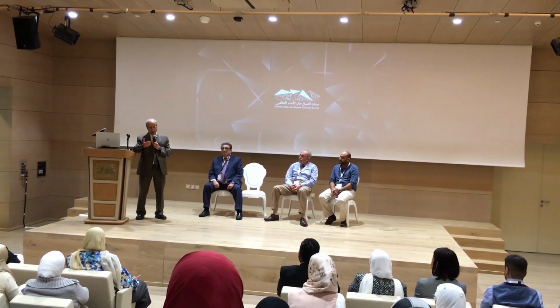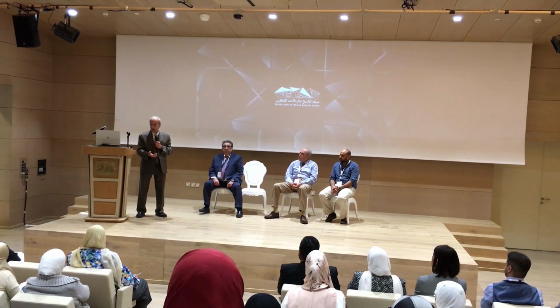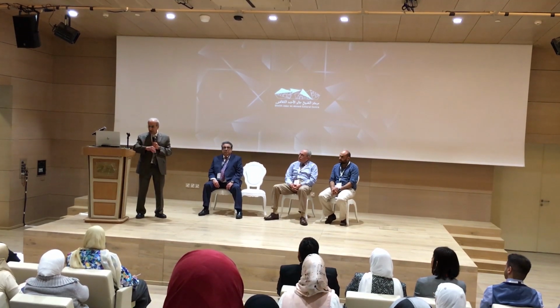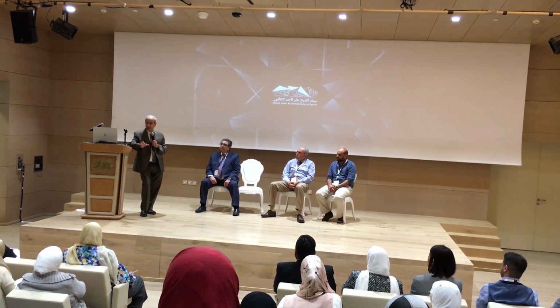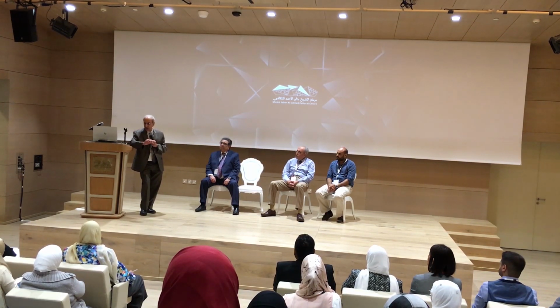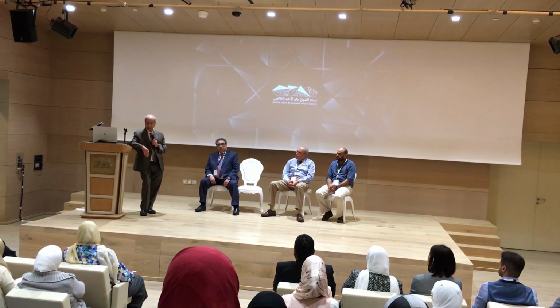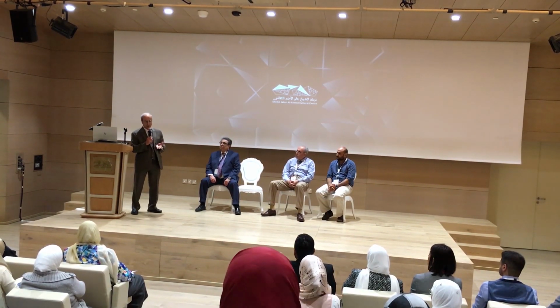Now, when we communicate with CAP, the staff have already studied also your information, and they give us a recommendation on how many team members you are supposed to use. So we try to stay within that limit. Okay, so I set up the team, I inform them, we give them their parts, everybody gets their checklists, we give them some pep talk, encouragement, whatever, reminders of what they need to look into, and we assign a date of travel and going to the laboratory, okay? So that's all set in motion. So we arrive at the laboratory.